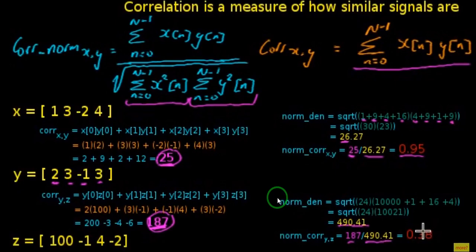Okay, everybody. Based on what we mentioned before, you realize that in order to see how similar two signals are, you should go for the correlation explanation. As you see here, we have two different signals and the different values at different times.